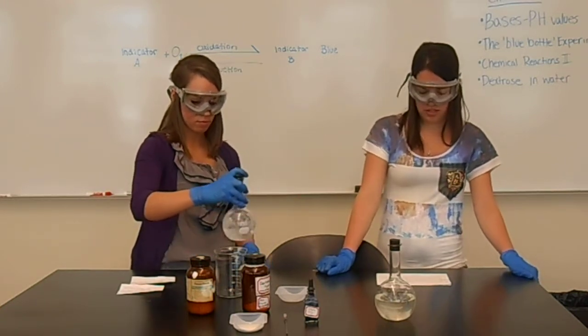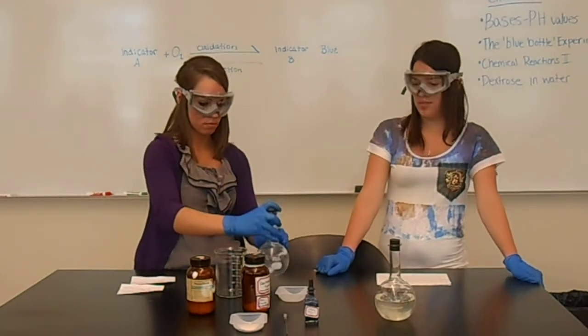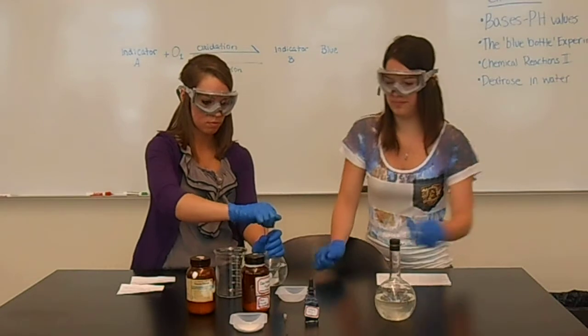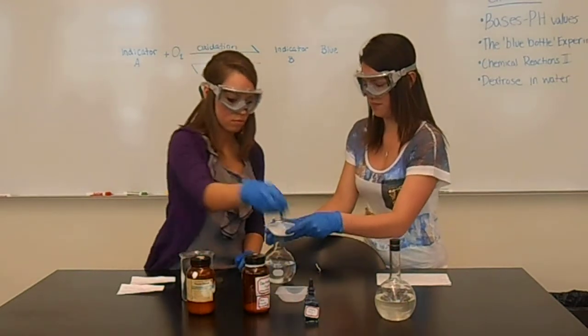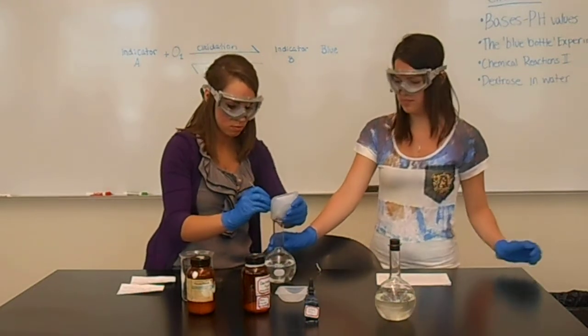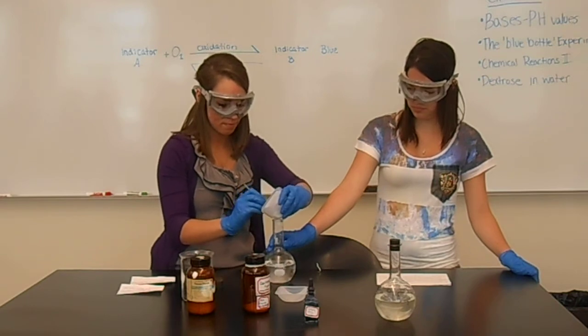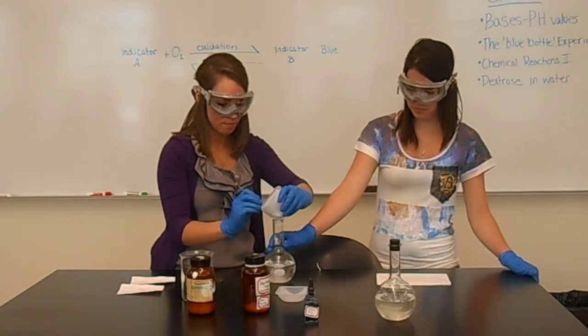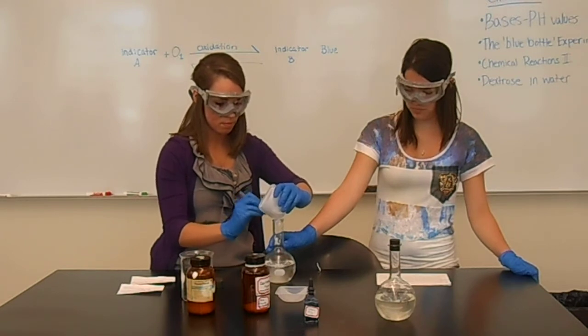After this dissolved, you will then dissolve the 10 grams of dextrose into the potassium hydroxide solution.